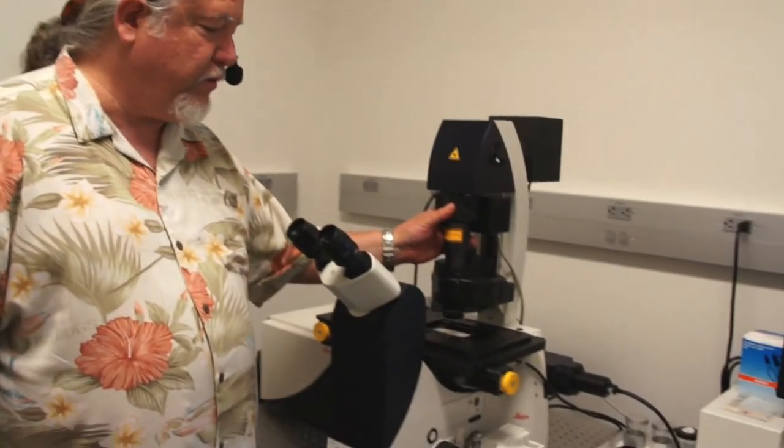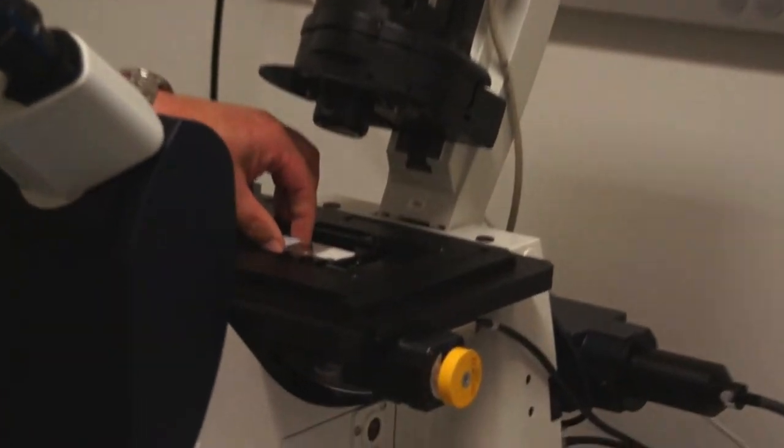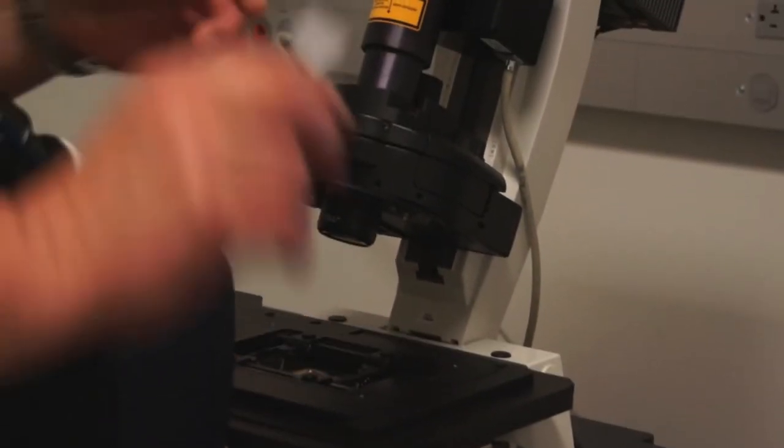Before we end our current session, it's important to follow proper shutdown procedures for using the light microscope. The first thing we do is rotate our condenser out of the way, take our specimen off the stage, and set it aside.